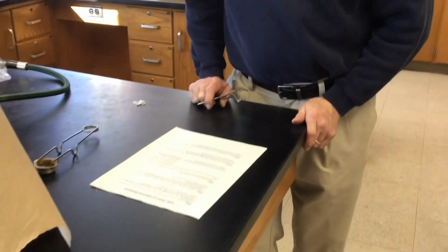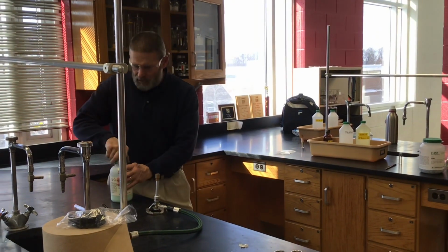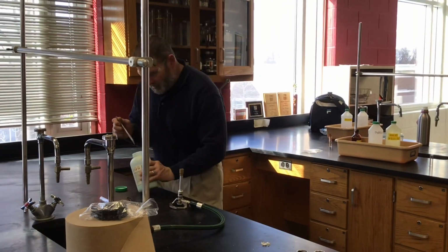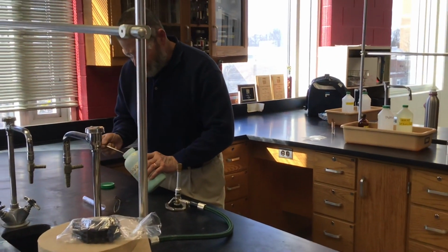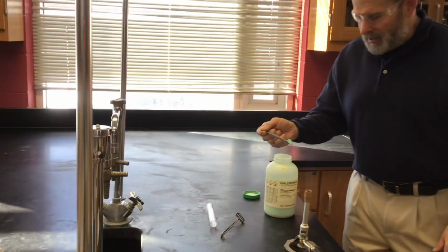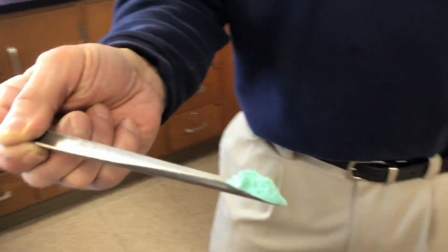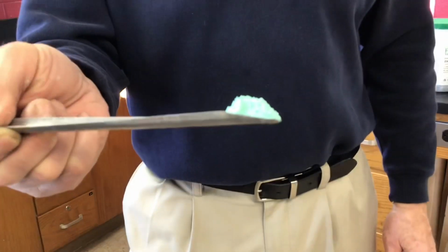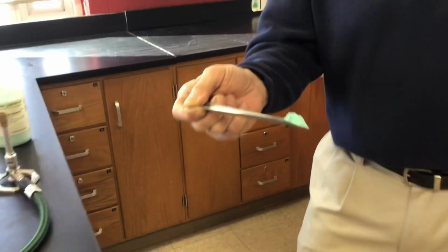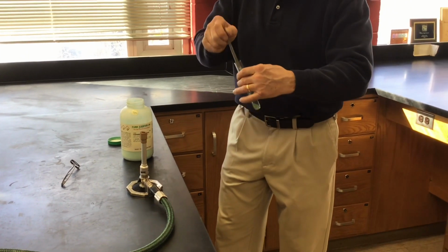Step 2 is we're going to heat up. I'm going to leave the burner on for step 2. Here we have some calcium carbonate. I'm going to correct you, that's copper carbonate. I keep saying calcium, and I heard you say that earlier too. Yes, this is copper(II) carbonate. It's a solid with a beautiful green color. I'll hold it up against the blue in your shirt so we can really see the color contrast. This is a great compound, nice looking stuff.